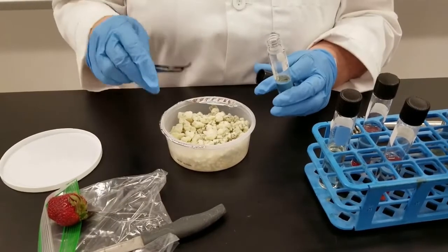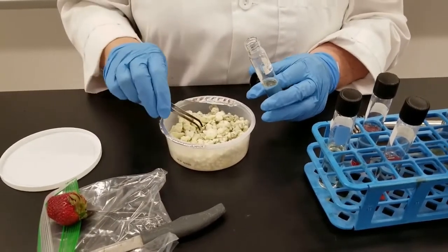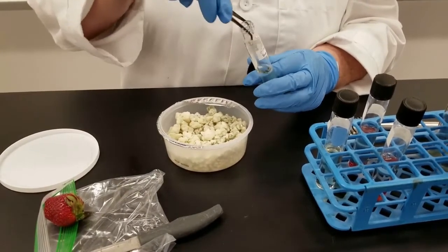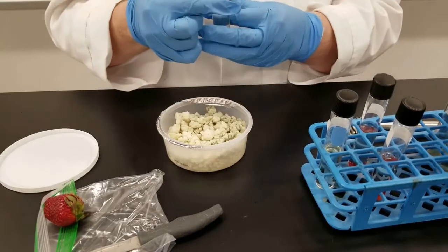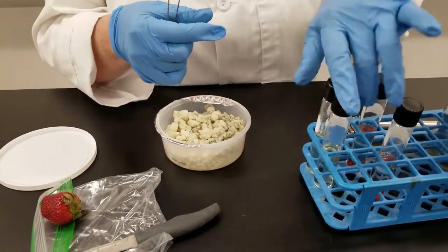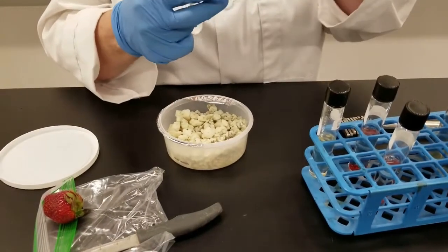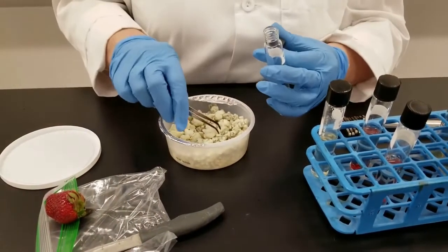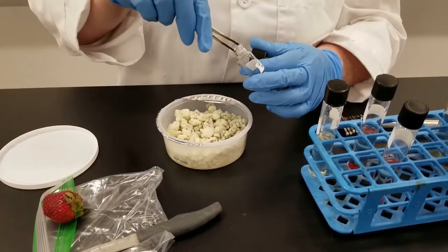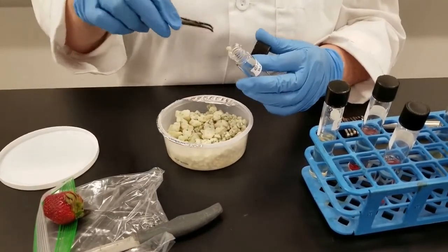That's fungi. This is blue cheese, and so we are also going to inoculate this into the Sabouraud. I'm just taking a chunk of the cheese, putting it in there, and like I say, we'll incubate it alongside the strawberries. And in 24 hours, we will check to see what type of growth we have of the fungi.